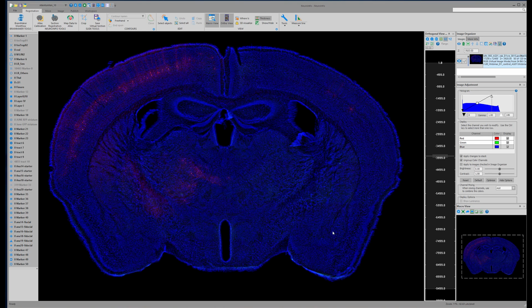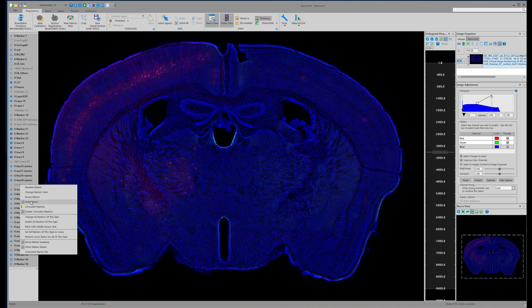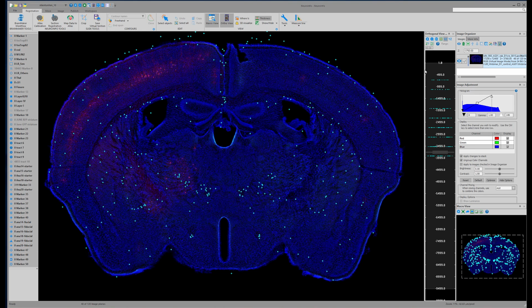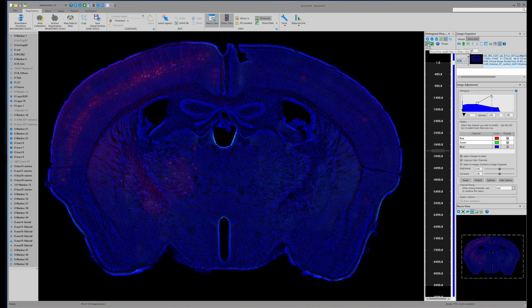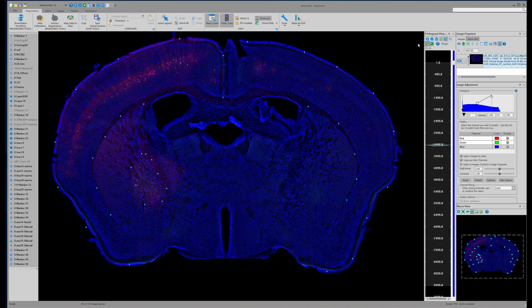So one thing that we do for registration, and this is something that we'll talk about later, is we put in fiducial markers. We put them here so that we outline the outer part of the cortex, the white matter that delineates the striatum, structures showing the globus pallidus.